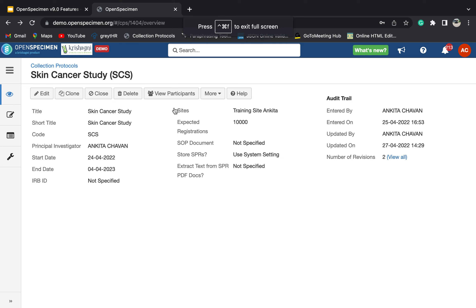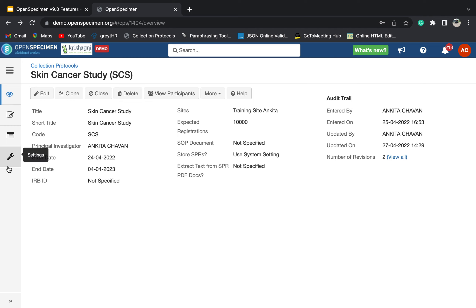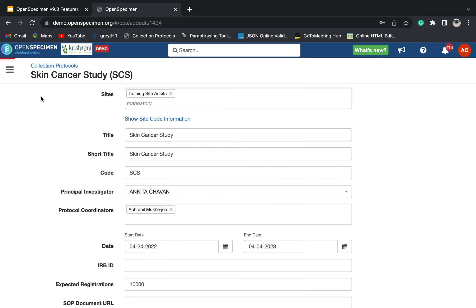Once you log in to OpenSpecimen, you can go to the collection protocol page and go to your specific CP. This is a participant-centric CP. Towards the left-hand side you can see there are different tabs. Let me give you the basic tour of the CP.